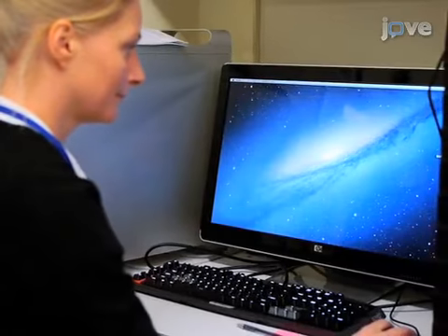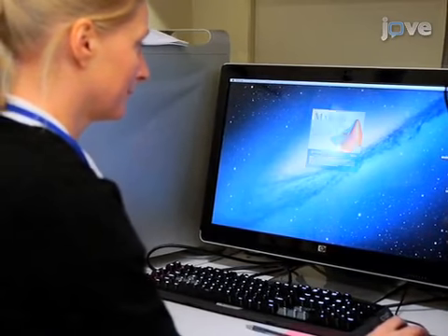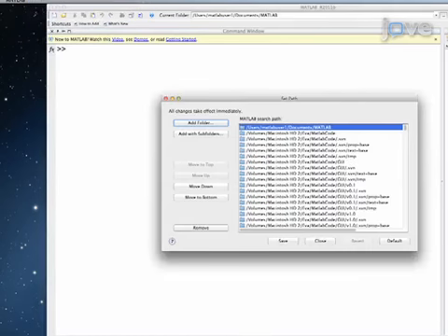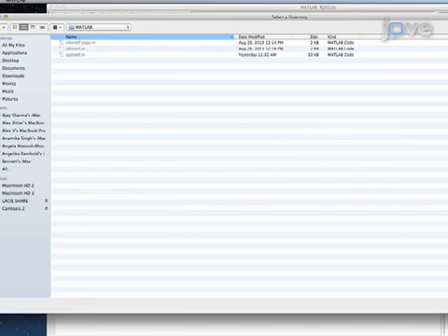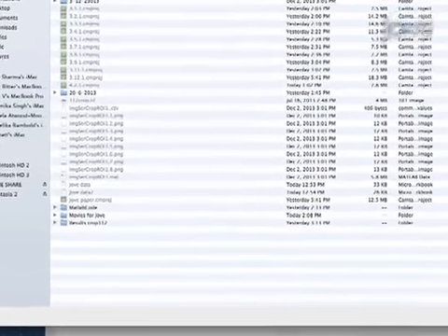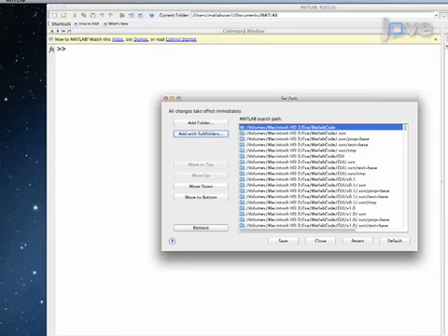The first time the kICS code is used, open MATLAB and click File, then Set Path, then click Add with Subfolders and find the folder on the computer in which the kICS code is located. Click OK before saving and closing MATLAB.